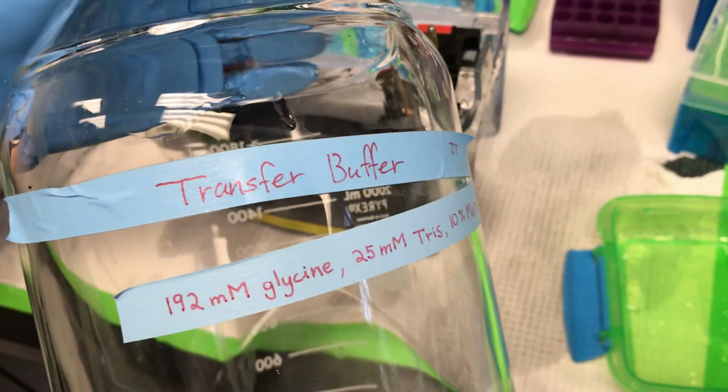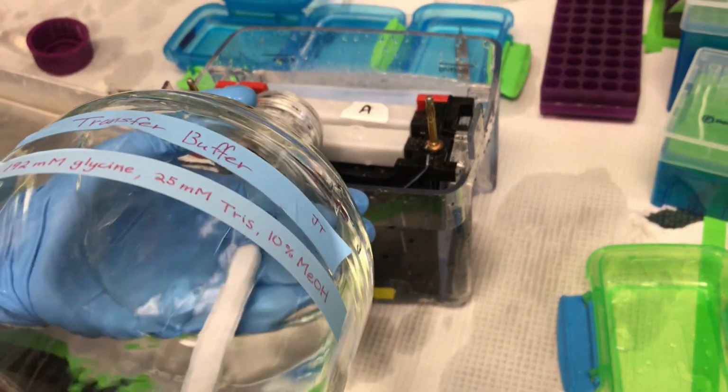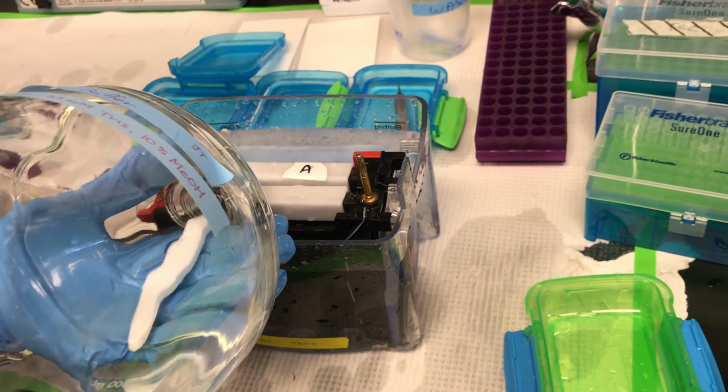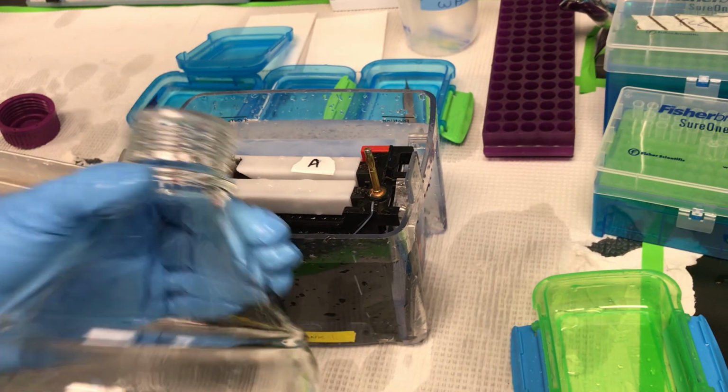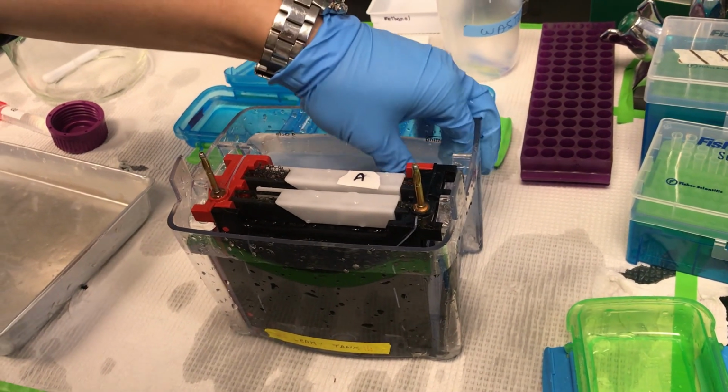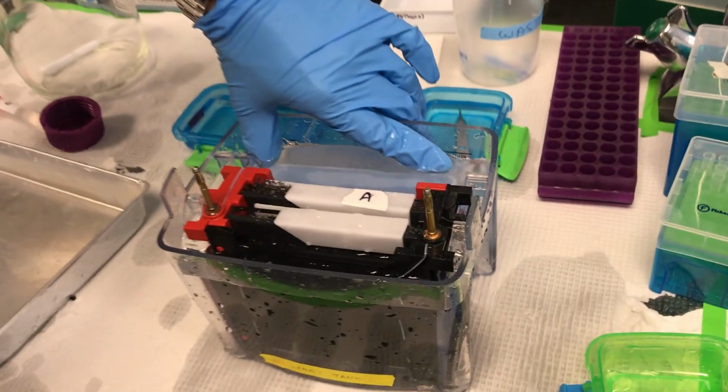Okay, good. Transfer buffer. Fit the cassette inside the Trans-Blot central core, always matching black to black, and place it in the electrophoresis chamber with transfer buffer and an ice pack before securing the lid.